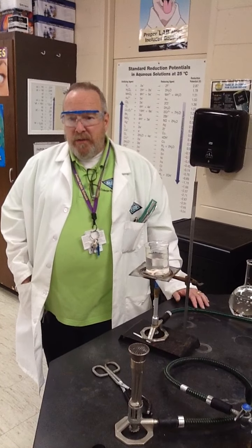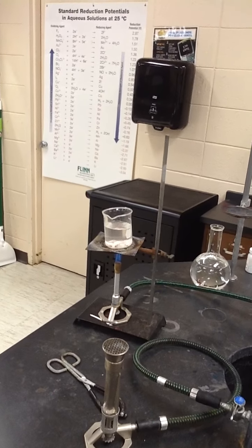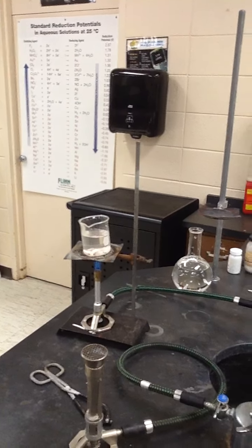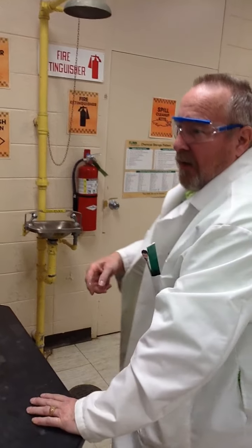And when we do this experiment, one thing we'll be doing is boiling our test tubes in there. Now there's a problem. How do I put my test tubes in there without burning myself? So let me get a test tube to demonstrate. We'll be using 10 by 75 or 10 by 100 test tubes like these.